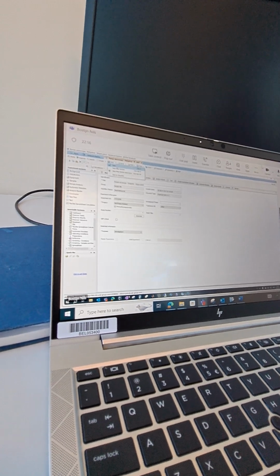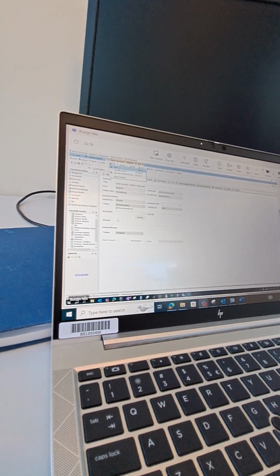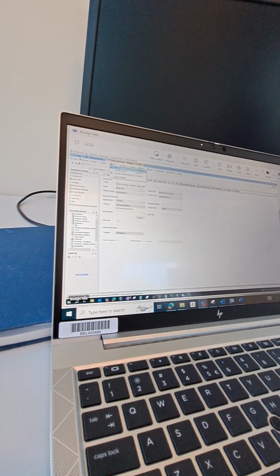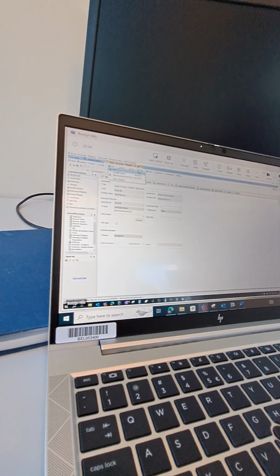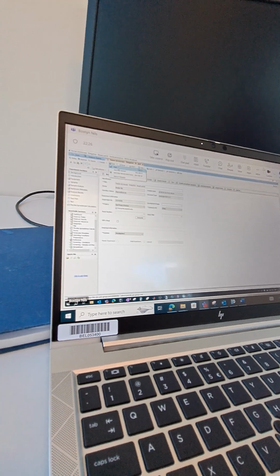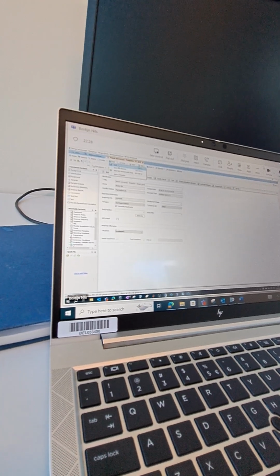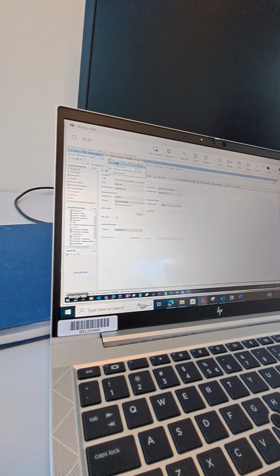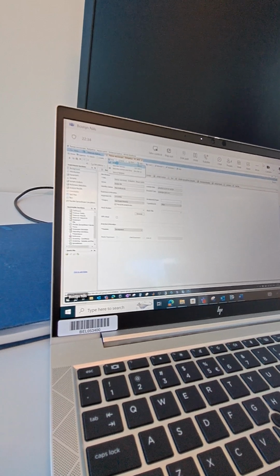So we write this ELN for every part which we are doing on a regular basis? Sorry, can you say again? I'm saying this ELN number should be for every experiment we are doing, and not only one ELN for all of the project. You can choose how you do this.